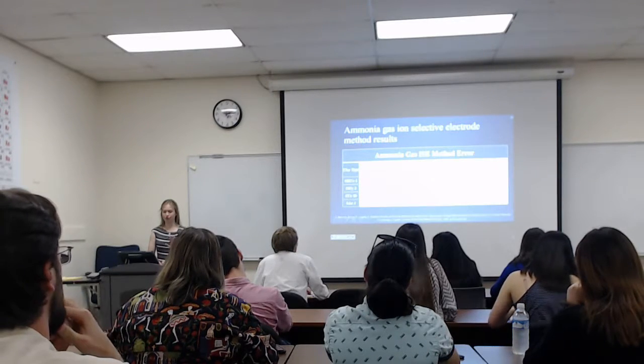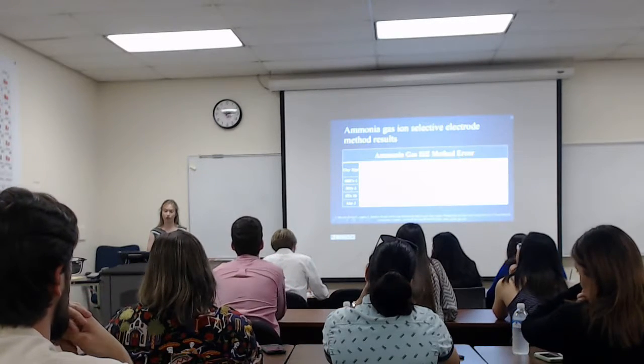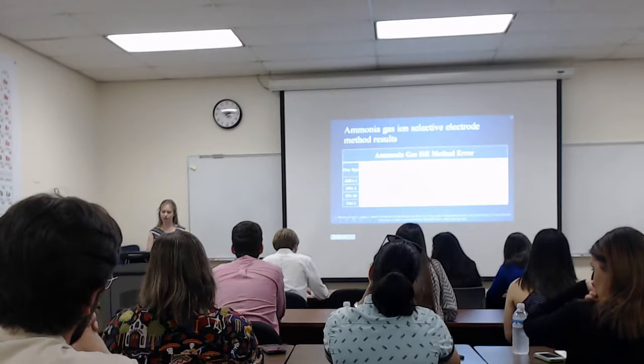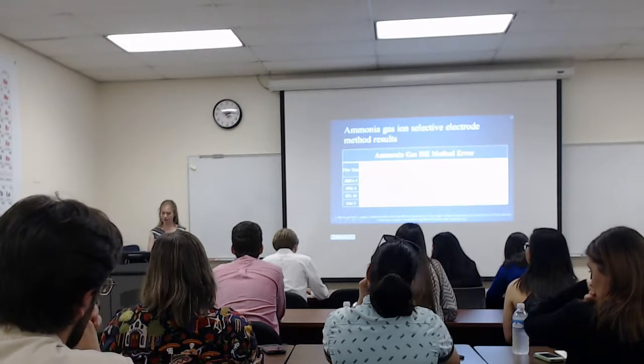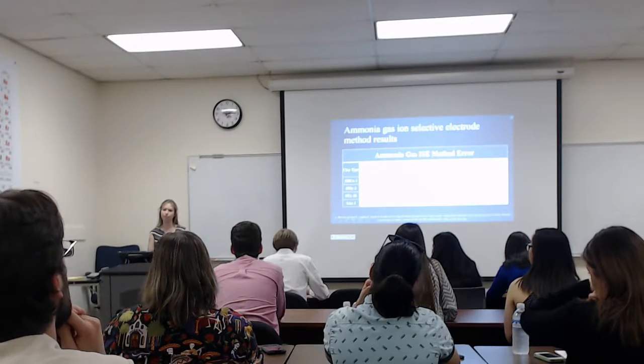Yeah, each trial is made up of 5 samples, and I run all 5 samples and all 9 standards at once on the same day. I do believe that I actually ran an entire set of trials for all 4 clays in one day.